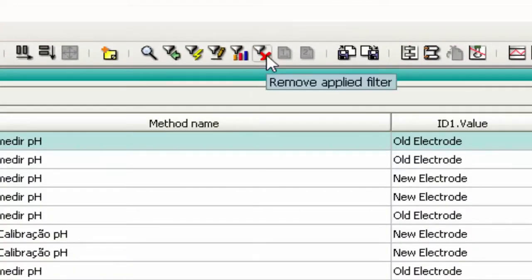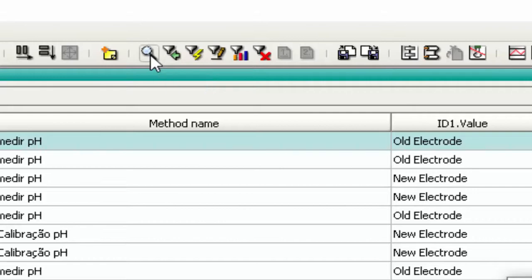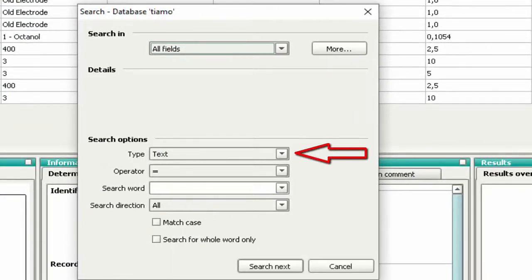You can also use the function Search when you need to find a sample with specific information. This function is recommended when we have many analyses in the database. Press the Search button. In Search options, you can choose to search for text, number, or date.